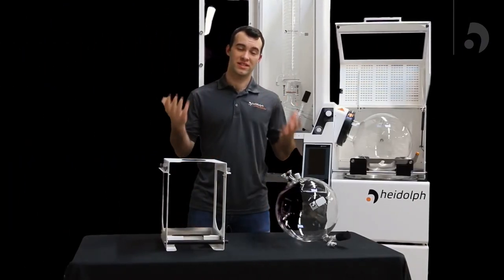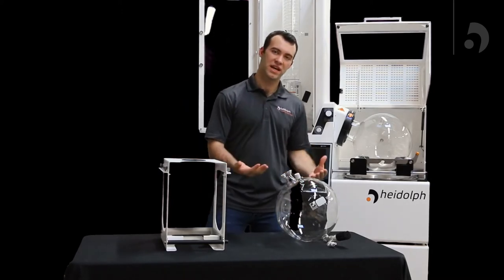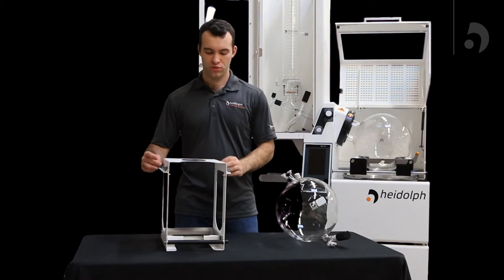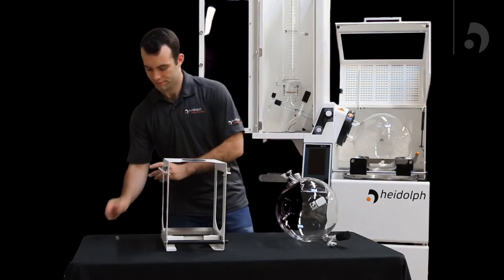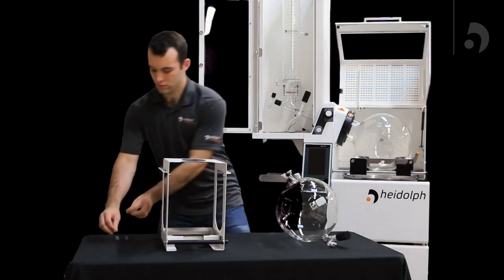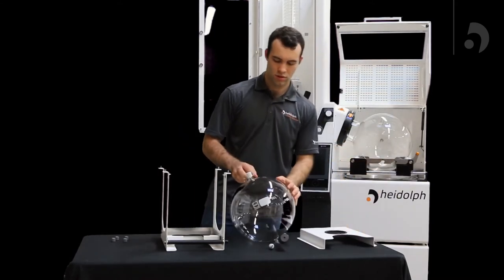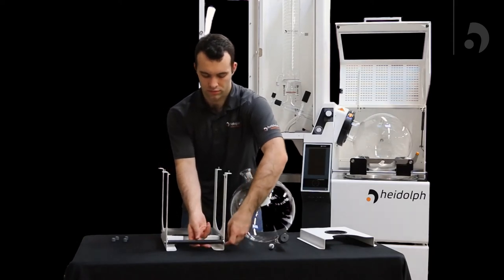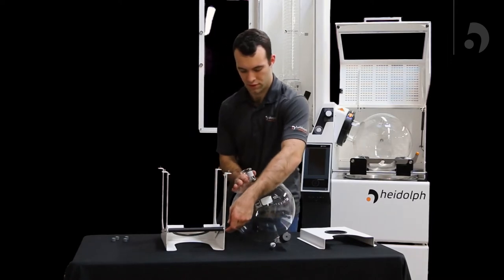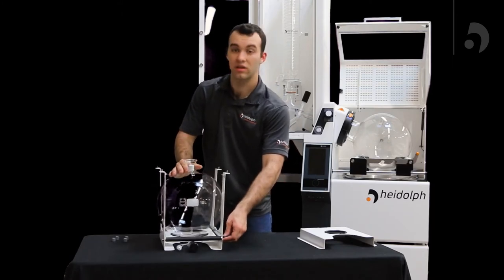The next portion of our assembly is going to involve the 10-liter receiving flask and the cassette. We're going to attach the 10-liter receiving flask to our unit. The first thing we need to do is remove the screws on the top of the cassette so that we can pull it off. We now want to loosen the screw on the support rod in the bottom and raise it to about halfway. Now we can slide the 10-liter receiving flask into the cassette.